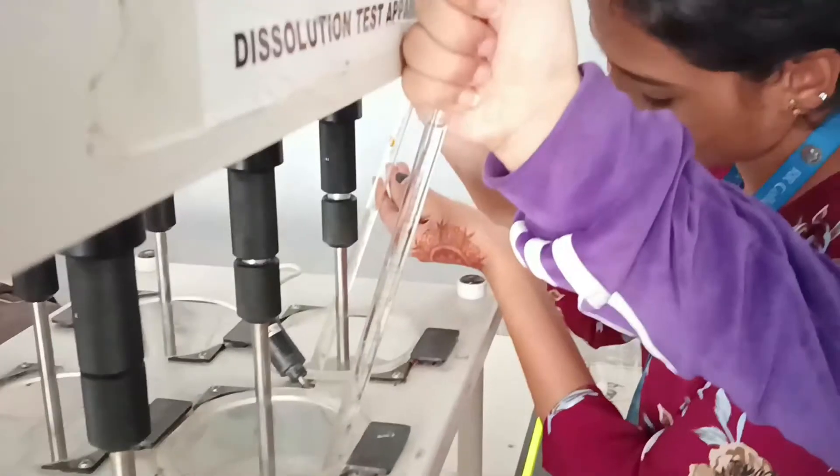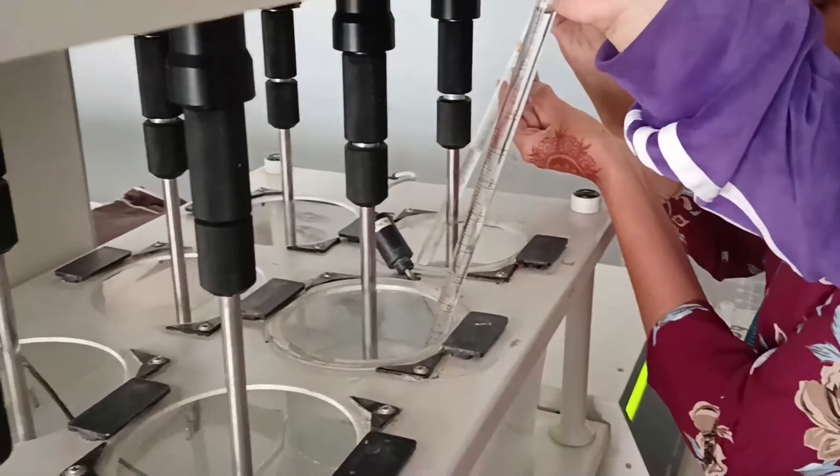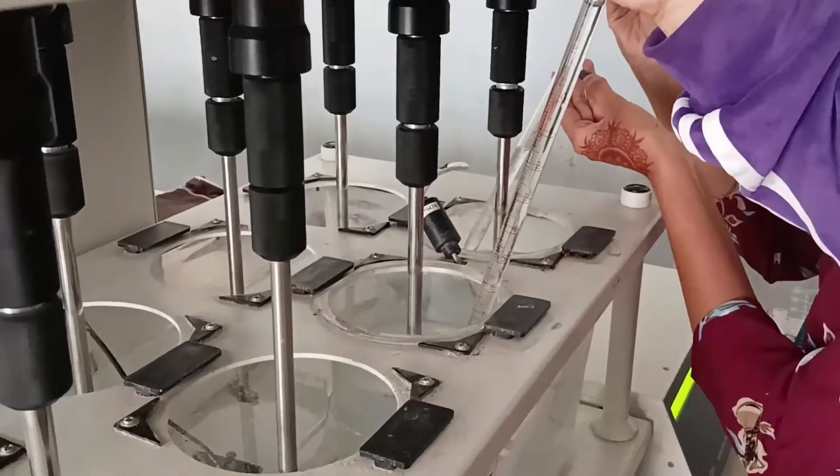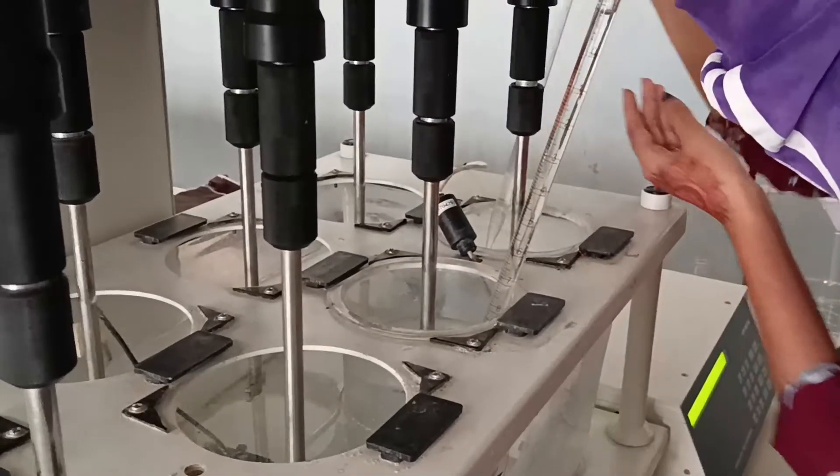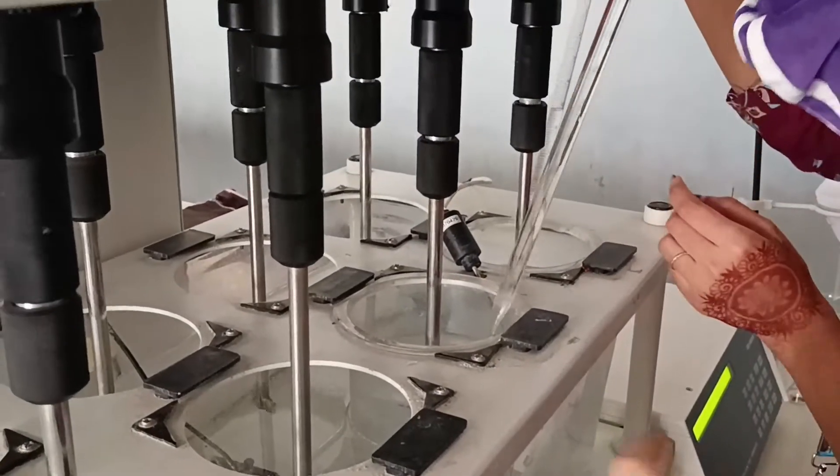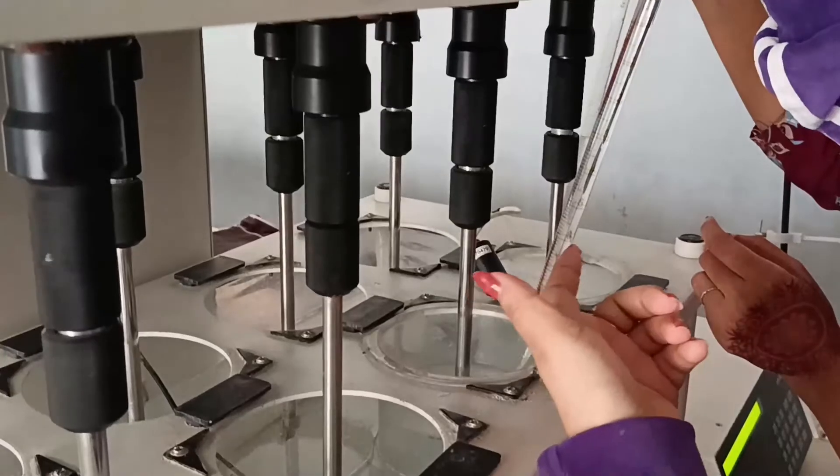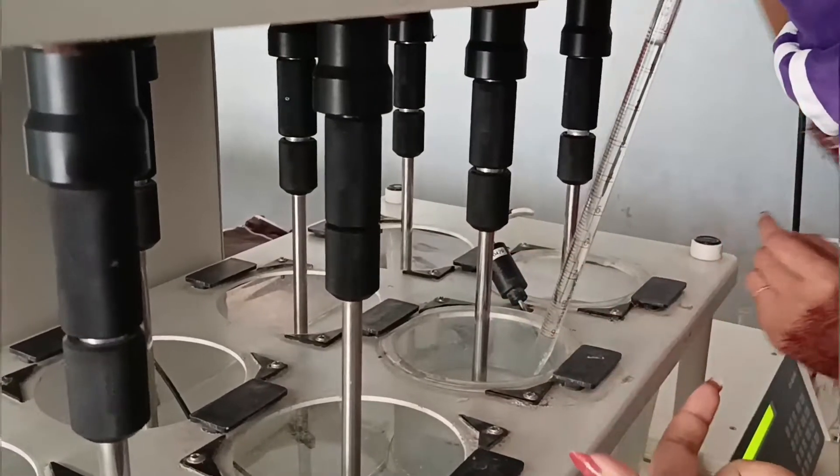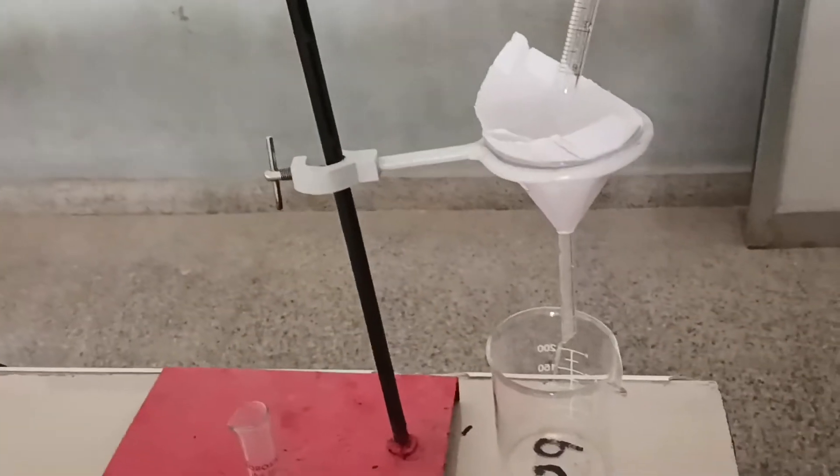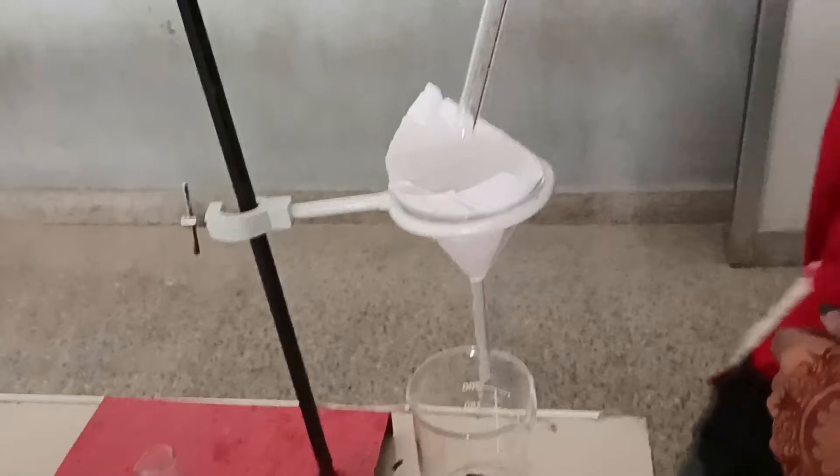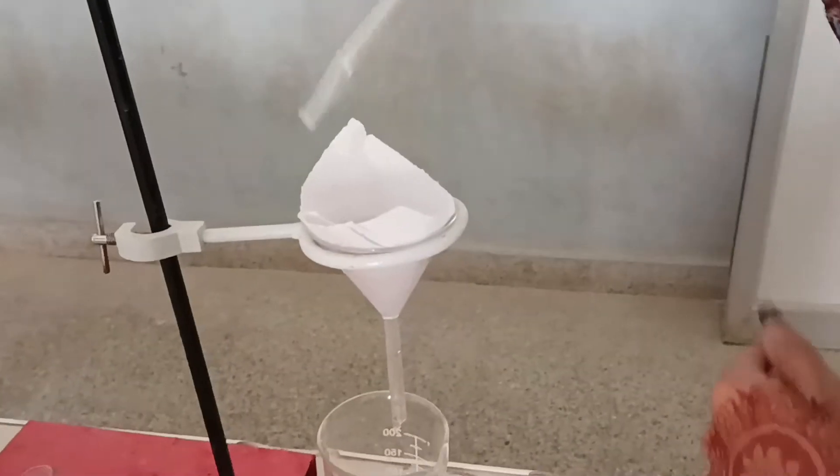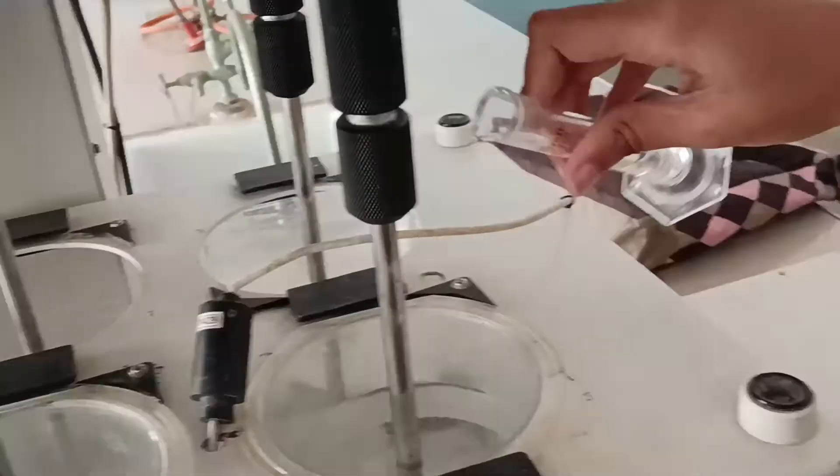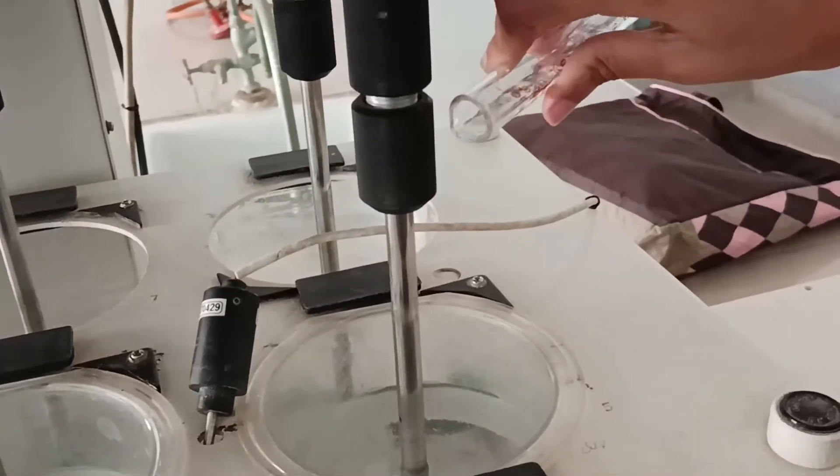She is taking 10ml from both - one is Calpol and one is Dolo 650. They are both taking slowly. After this you have to filter and add fresh prepared buffer inside that.